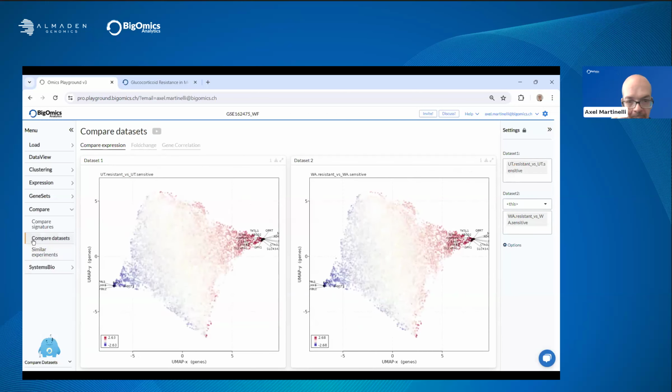And once you have a data set you're interested in, you can then look at it in more detail by going here, selecting a data set from the list of uploaded data sets, and then doing a one-to-one pairwise comparison between the data sets, which extends to looking at these UMAP plots, but you can change that.